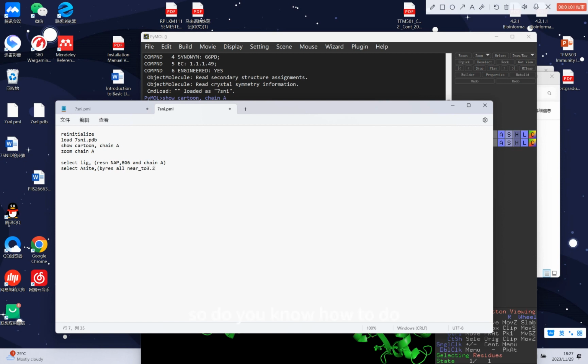So you know how to do right click, right button, and then you drag. And you can see all the sticks already. So far so good. Try to finish this one in 10 more minutes, then we'll move on to the next one. Okay.